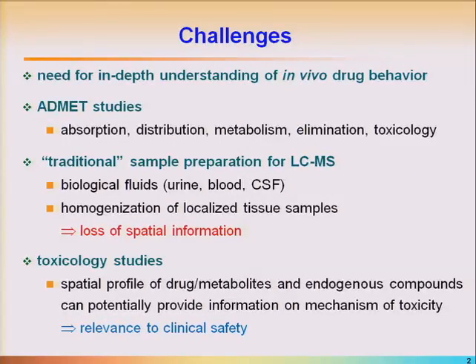In drug discovery and development, the challenge is to get an in-depth understanding of the final, ultimately in vivo drug behavior, which is achieved with detailed ADME studies, which are absorption, distribution, metabolism, elimination, excretion, and toxicology. And while the gold standard for analyzing these samples is liquid chromatography, LC-MS, when you have biological fluids such as urine, blood, and CSF, you just perform a dilute and shoot or protein precipitation or solid phase extraction, and you can then analyze it by LC-MS.